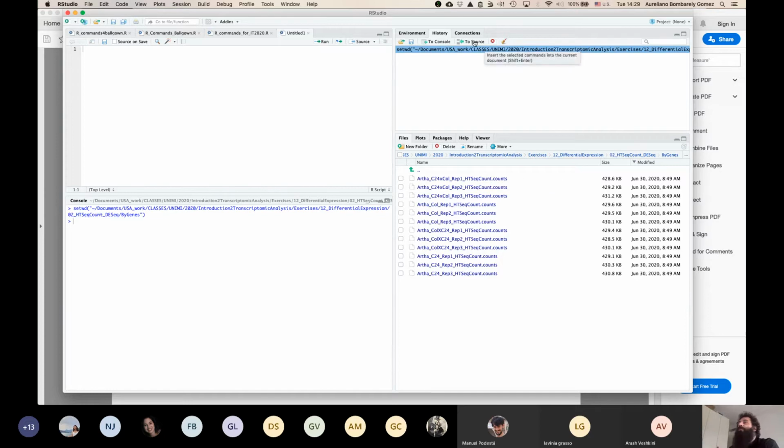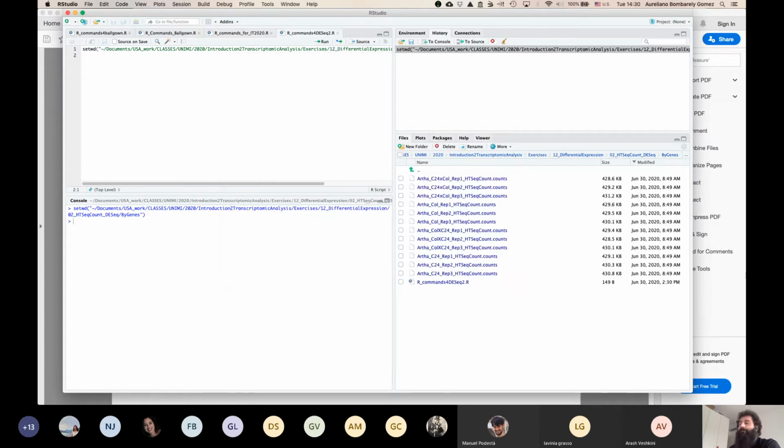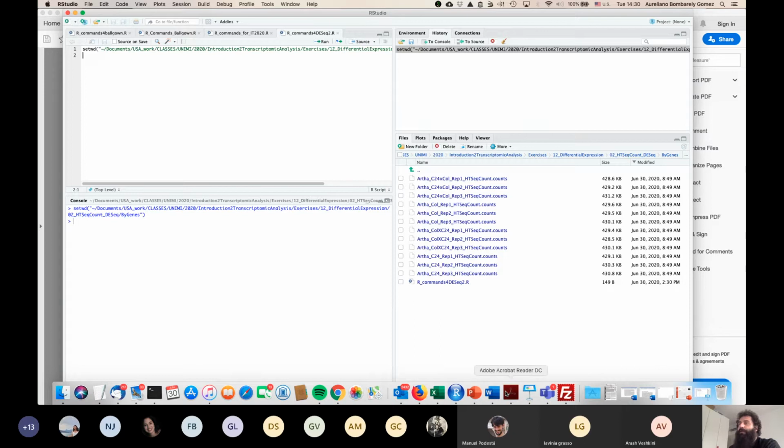We are going to just use this to start this other script. So that is the previous step.